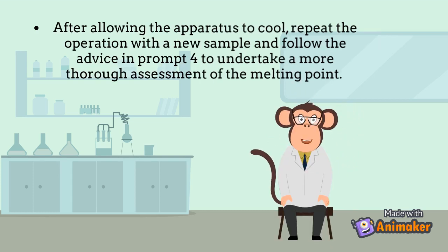If the compound's expected melting point is unknown, heat the sample at a medium rate for the duration of the experiment to determine an estimated melting point. Assessment of the melting point.